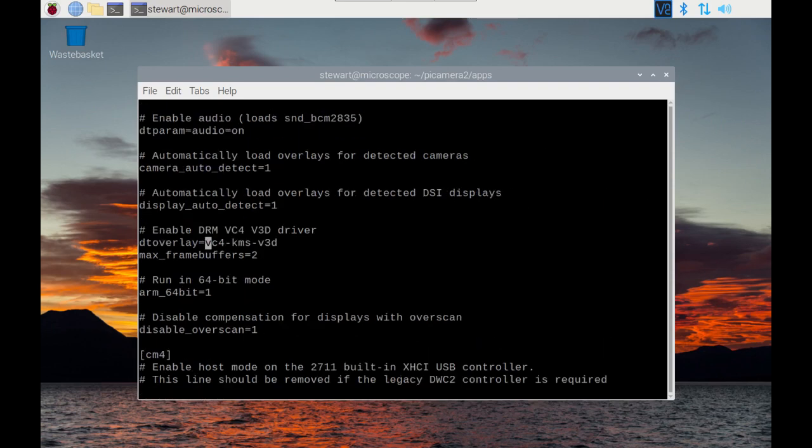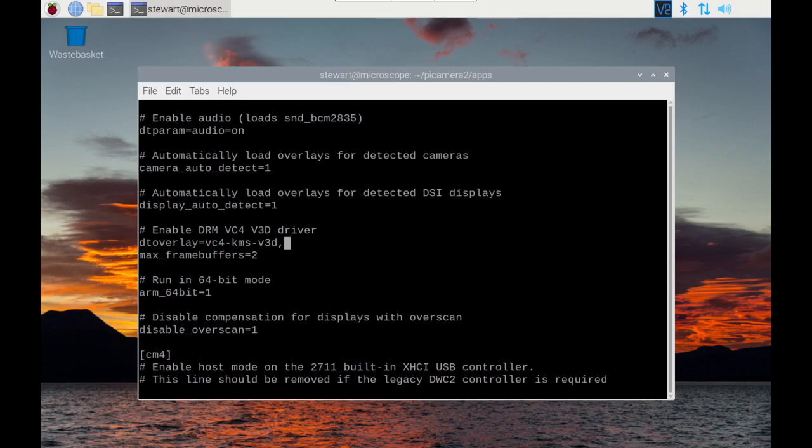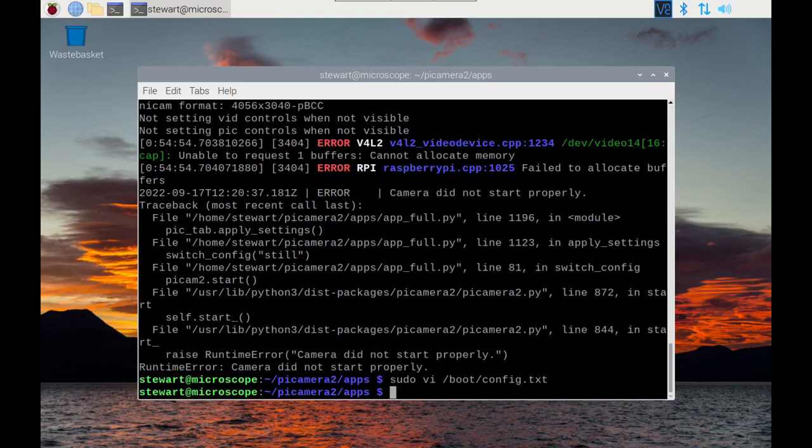What we want to do is just edit this line and just add cma-320. You could replace that with say 384 or 512 as I suggested. For that to take effect, just save that. We now need to reboot.